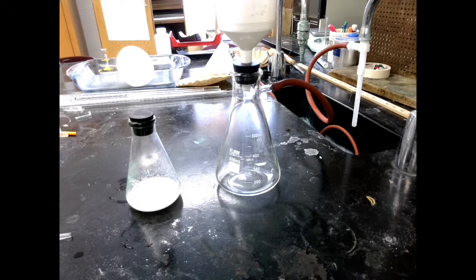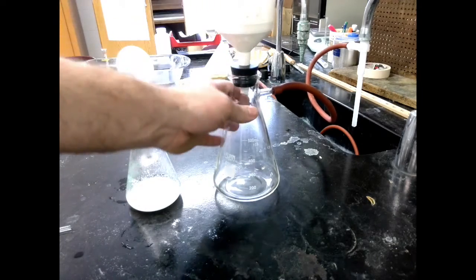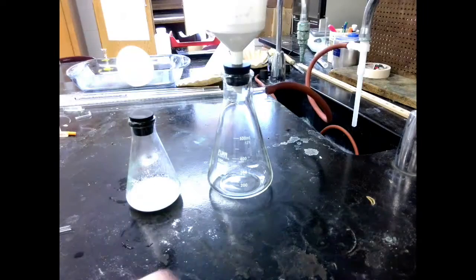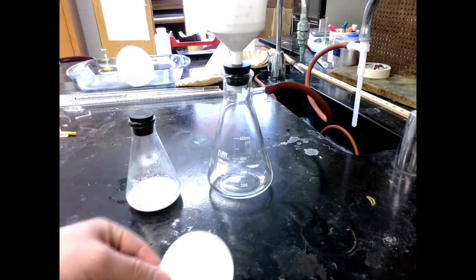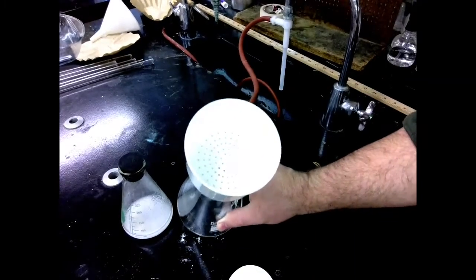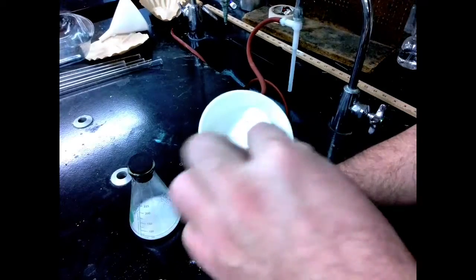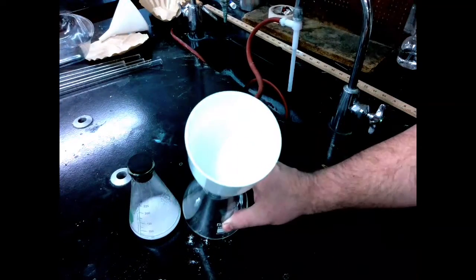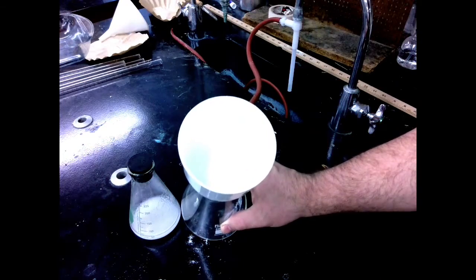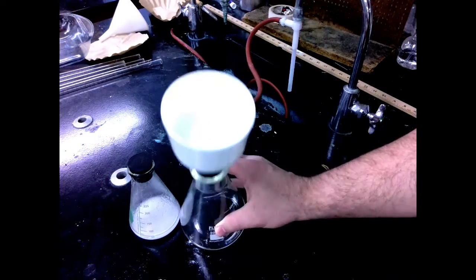So what I need to do is set this up. I need my Buchner funnel and flask, I need my aspirator here, and I need to get some filter paper. This filter paper will fit right into the Buchner funnel. So I've got my funnel set up here and ready to go. I'm just going to place my filter paper inside of it. I'm going to wet the filter paper a little bit and turn on the water so that it pulls it down nice and tight, forming a seal.